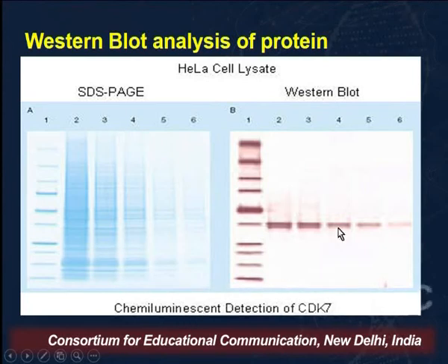So if we add those antibodies against these compounds and we check what happens in the normal cell line and in the diseased cell line, then we see either there will be an increase in expression. In the normal cell line there was no expression of tweak, but in the diseased cell line you can see the band for tweak. And obviously you have a positive control, so you can identify that this is the protein that you have used to create the primary antibody, for example, or you can use the purified available tweak protein as well.